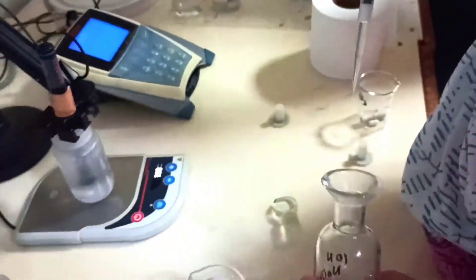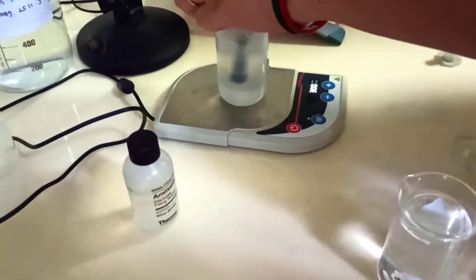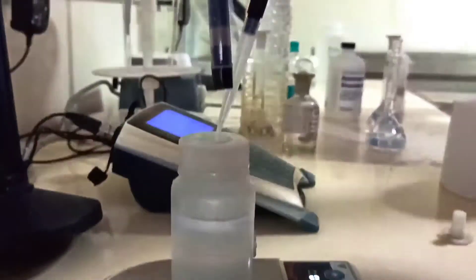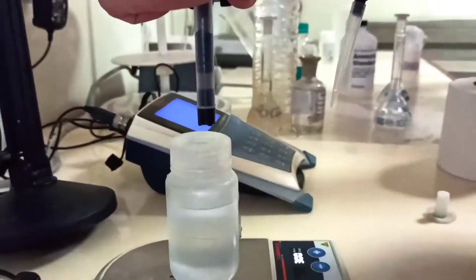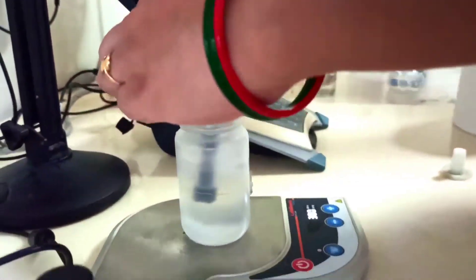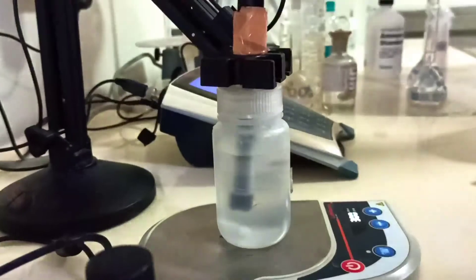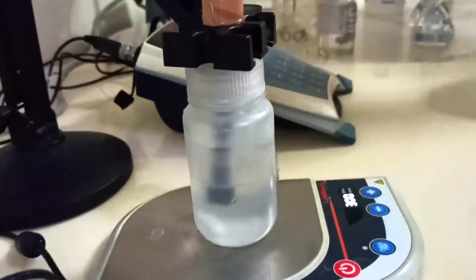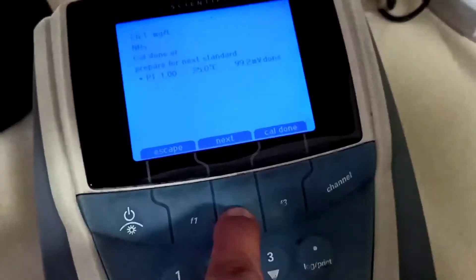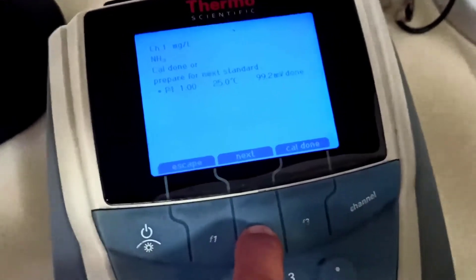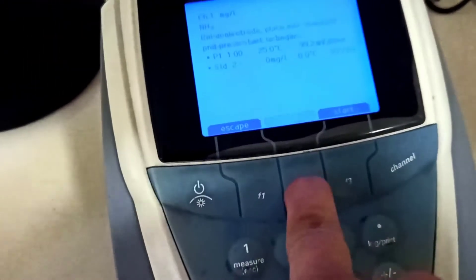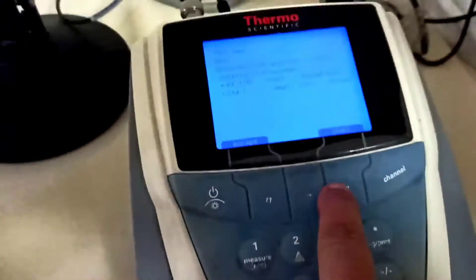We use such type of micropipette for getting accurate and precise measurements. You can see such type of bottles we are using in which the ammonia is liberated only inside, not moving to outside. Our next calibration starts with 10 ppm.